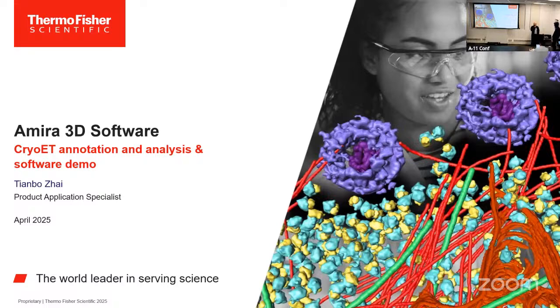Okay, so we'll begin today. We basically went through sample prep, pre-processing, data processing, and then the next step in the CryoET workflow is analysis and annotation. And so we have a couple speakers from TFS, Tianbo Zhai and Mark McClendon, and they'll talk about AMIRA.